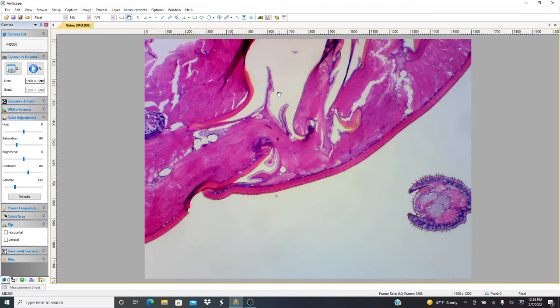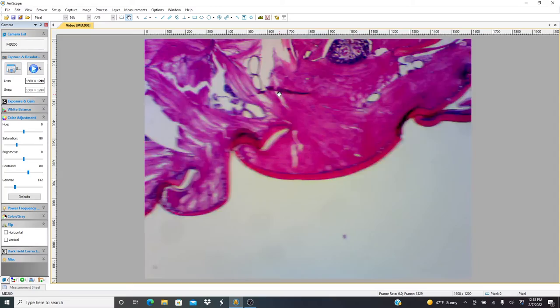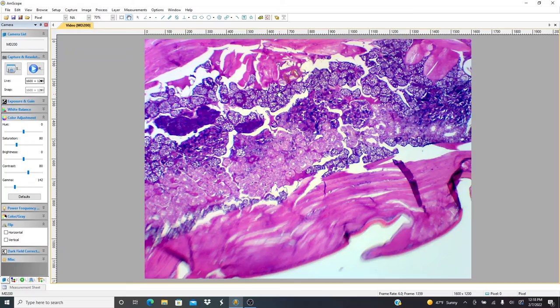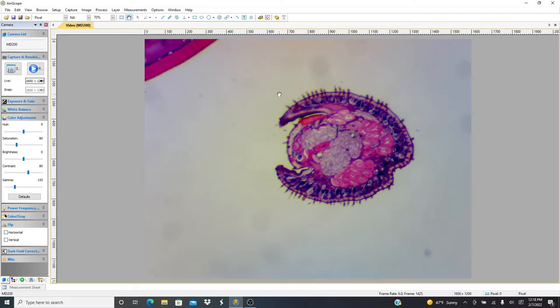This is the head around here, and then this is kind of going down the body. We were able to section maybe about a third of it. I think it's pretty fascinating to look at. We actually didn't cut much into the legs, but right here, I think we've got a cross section of a leg. It looks pretty cool.